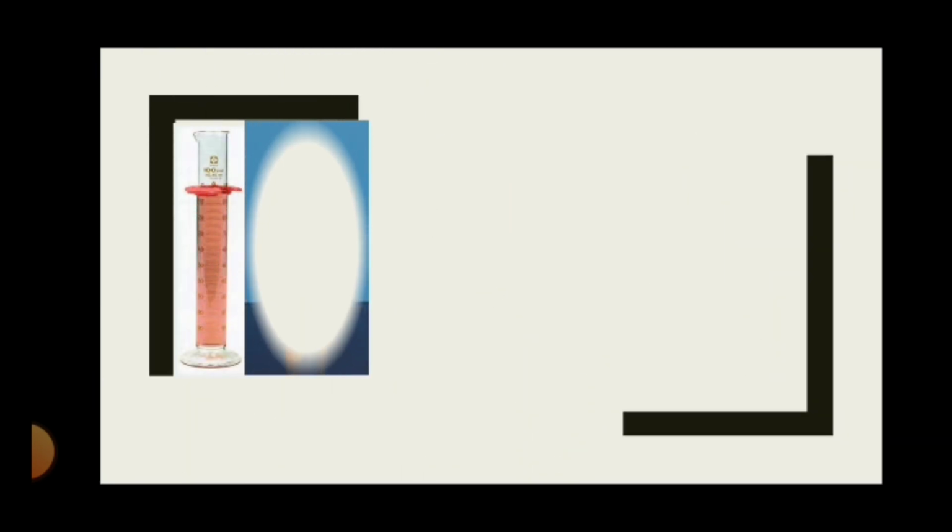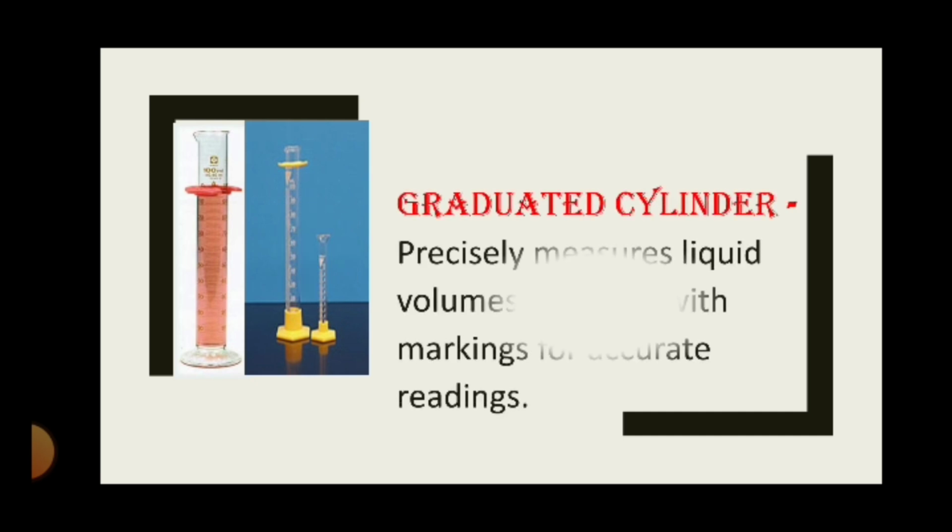Next is, 28 na ba nito? So marami-rami rin to. What you can see in the pictures, yes, you are correct. This is graduated cylinder. Well, graduated cylinder comes in a lot of volumes, no? 100 ml, 150, and 1,000 ml, very huge, malaki din siya.